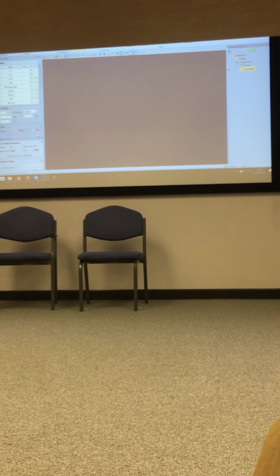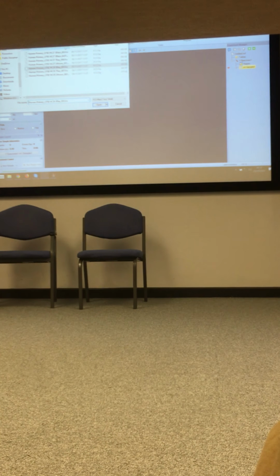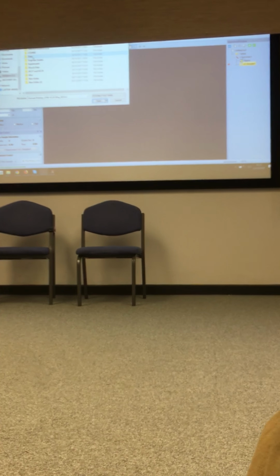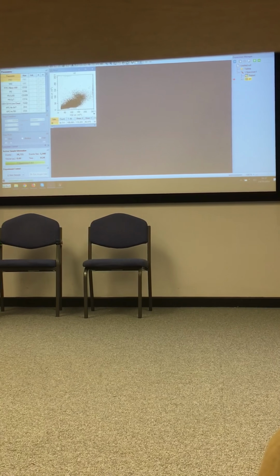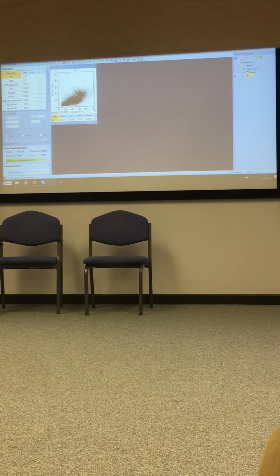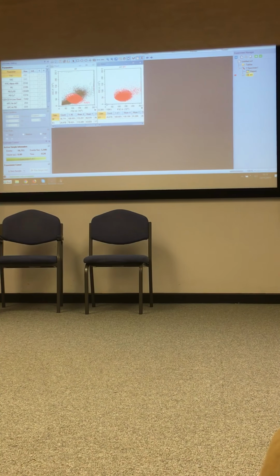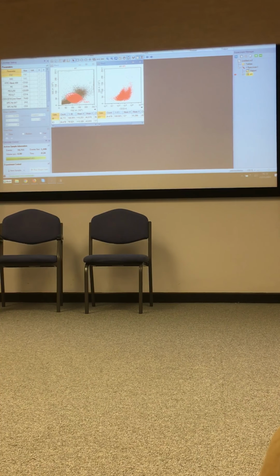a new sample. Let me just import the FCS file. Where is it? Desktop. Upload your data. Run. Okay, so we get the same forward and side scatter. That looks pretty similar. And then we do CD32 versus CD86. That is not a bi-exponential plot.